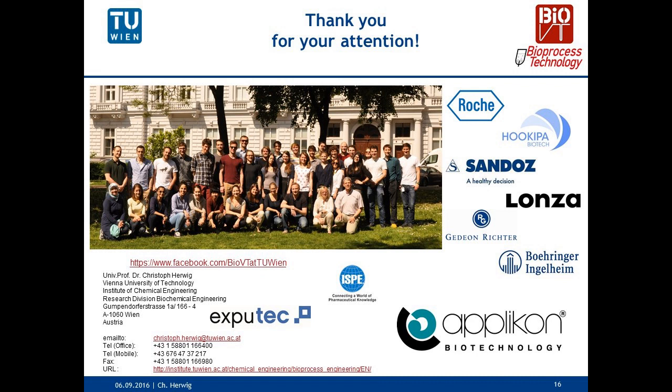We are not emphasizing just measuring more to have more data. We are mainly having a look at what kind of data you have already, and then in the second step we analyze which additional data source actually gives you additional information or knowledge which you can apply for acceleration of bioprocess development.